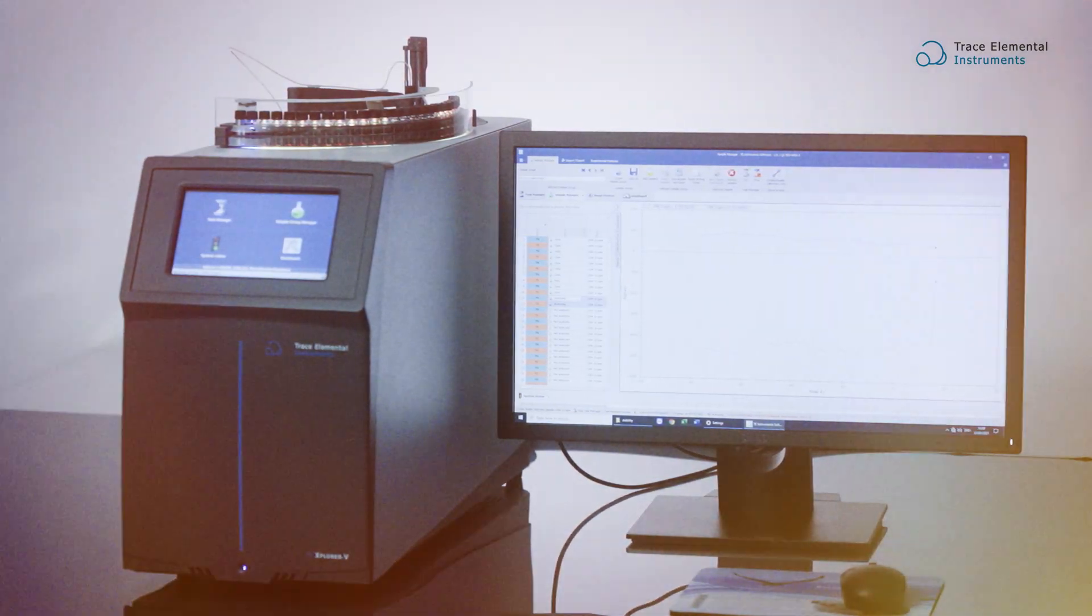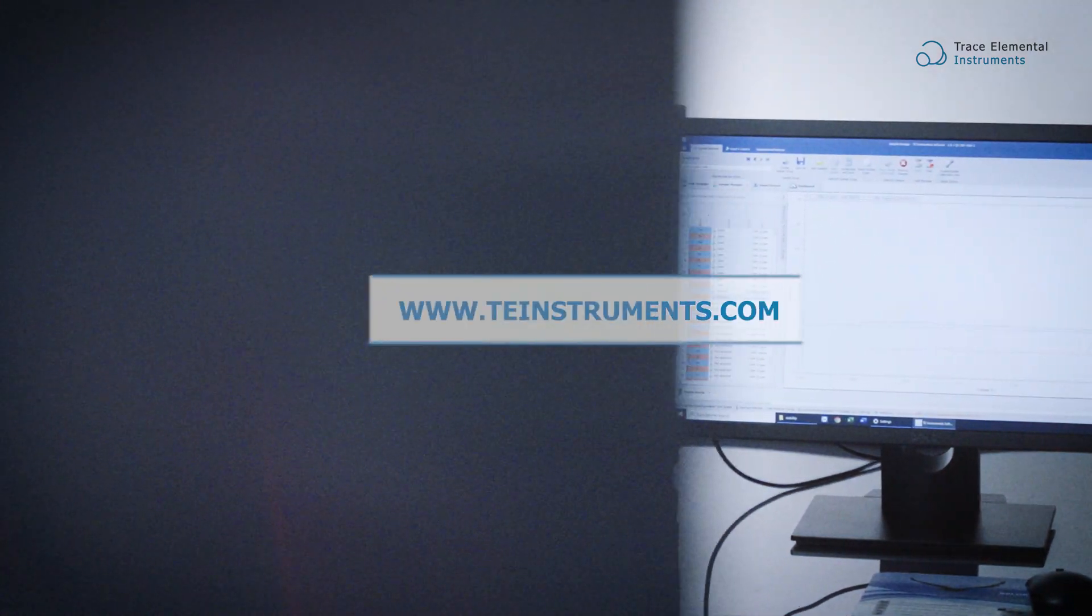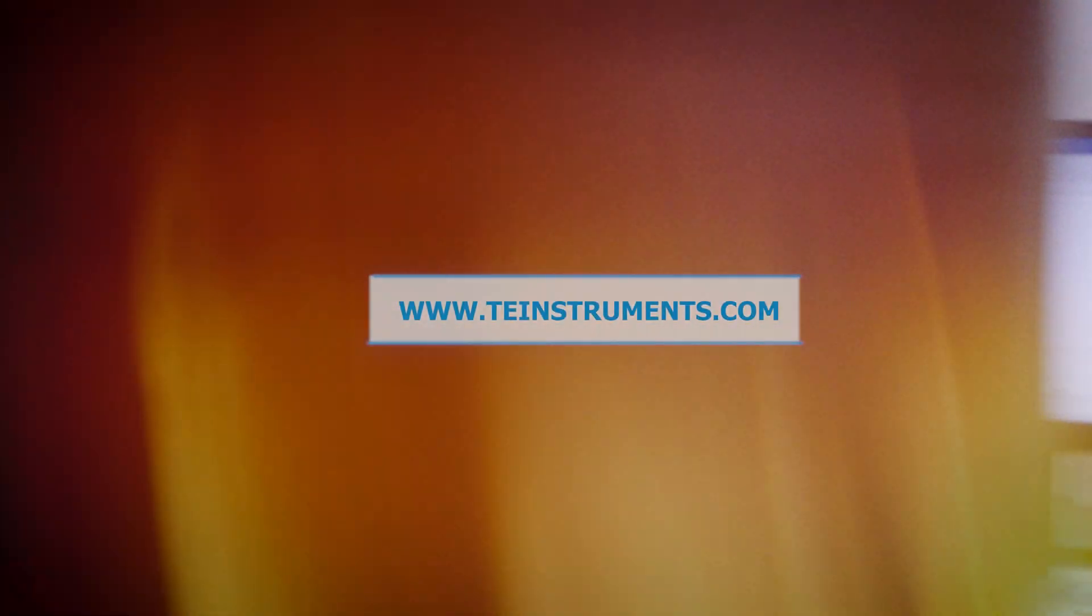Explorer V is the robust and stable analyzer for your lab. Interested? Contact us for more information, www.teinstruments.com.